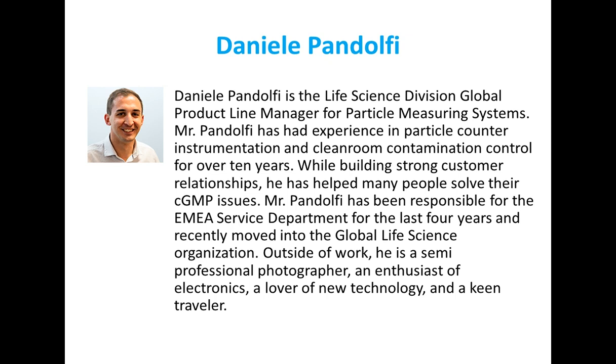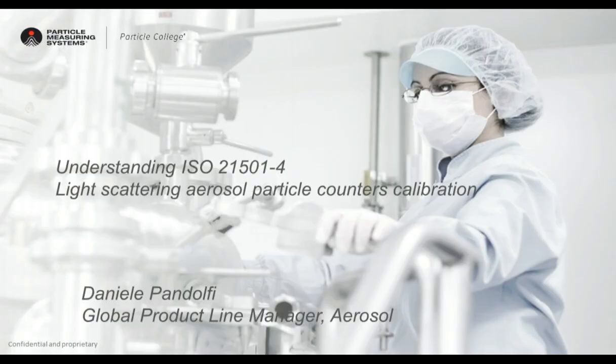Thank you, Mike. Thank you for your kind introduction, and welcome everyone to today's webinar. As Mike's already explained, the topic of the day is understanding the ISO 21501-4 standard, which specifically refers to light scattering aerosol particle counter calibration.